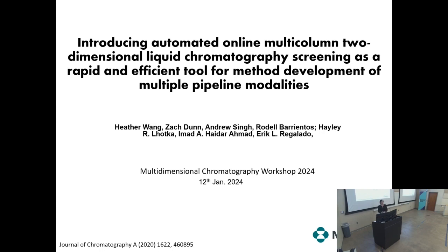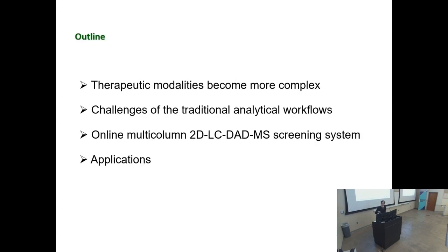So the work I will talk about is what we did in our lab: introducing automatic online multi-column 2D-LC screening as a fast and efficient tool for method development of multiple pipeline molecules. Okay. The outline for this talk is, I will talk about the increased complexity of therapeutic molecules, and also the analytical challenges we're facing with traditional analytical workflows.